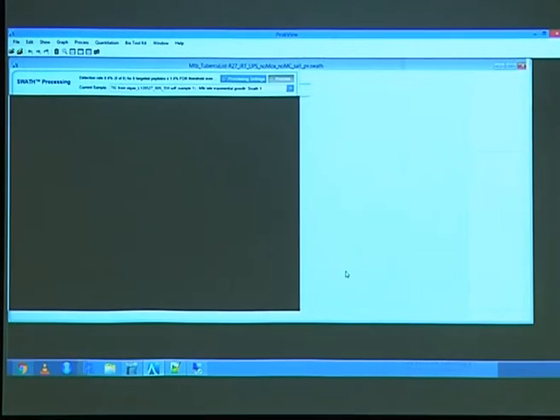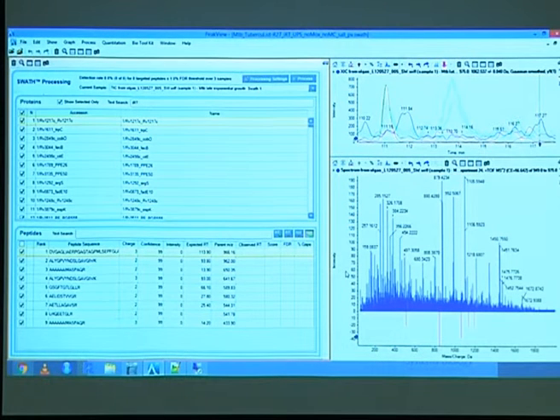Also, the TripleTOF, I don't know how many of you have access to one, it allows you to have one WIFF file with multiple runs in there. You can load these as well in here. I mean, well, it's their software.